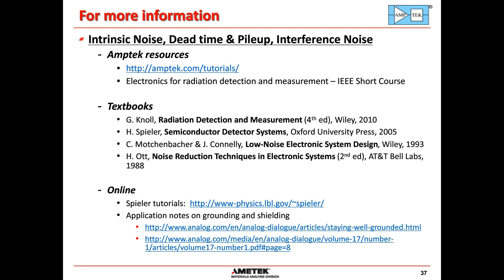So you can see that if you have set the thresholds in the system correctly, you will not see that, but by incorrectly setting some of the parameters, you can see that. In the next webinar, which will be given 6 or 8 weeks from now, I will discuss in more detail how to set these parameters: what's the optimum fast channel time, slow channel time, and how to set the thresholds. It's a good question. You will not see it if it's set correctly.